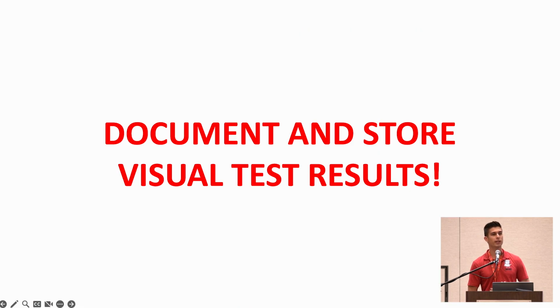If you want the report that I would go to sleep reading anyway, you might as well take some pictures and some videos, upload it into cloud storage to where people have access to it. If you're a lab manager, your EHS person, your fume hood users, they have access to see visually and understandably, does this hood contain or not?